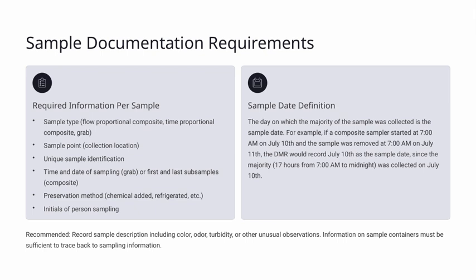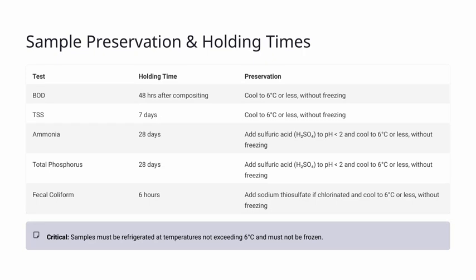unusual observations. Also, ensure that the sample container information is detailed enough to trace back to the sampling details. All this information helps maintain the quality and traceability of your sample documentation. Let's take a look at sample preservation and holding times for different tests.